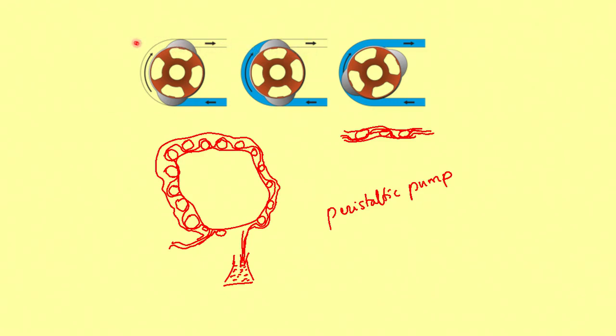This is the second stage where the ball bearing has moved slightly to the left and liquid will move to the right, and same thing. So, now the liquid has been sucked up to this point, and then in the third stage when the ball bearing moves like this completely, the liquid will be sucked like this and then it will be going through the peristaltic pump. The advantage of such a peristaltic pump is that the sample does not come into contact with the metal parts of the peristaltic pump.